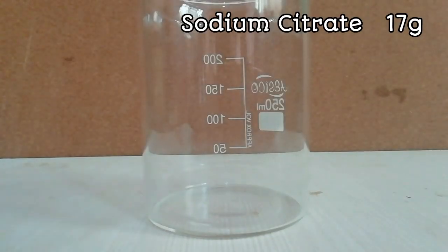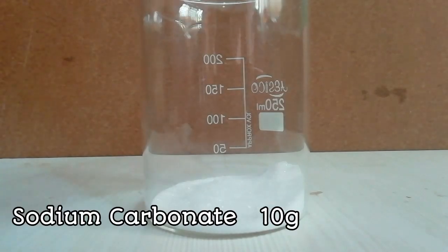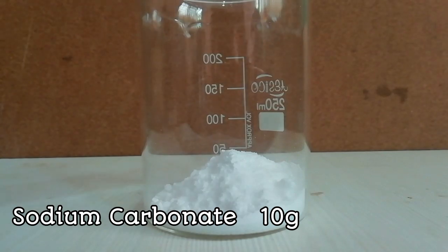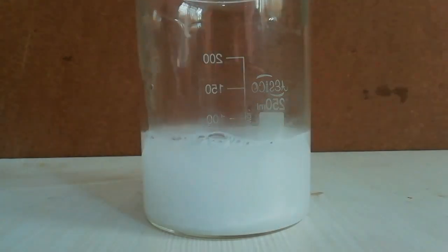Then add 17 grams of sodium citrate and 10 grams of sodium carbonate to a beaker. Then dissolve both compounds in 80 milliliters of warm water.